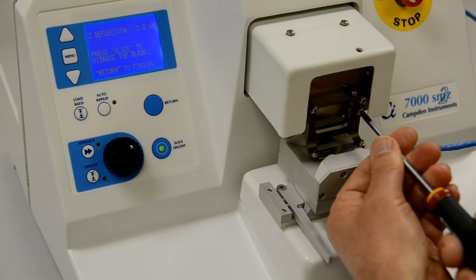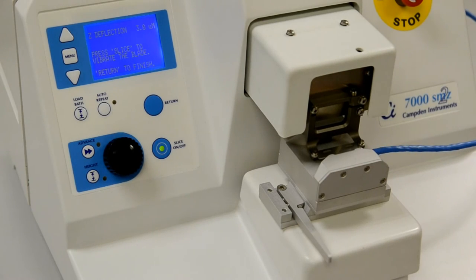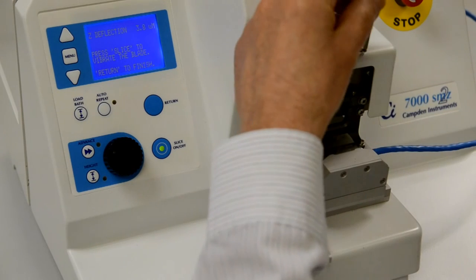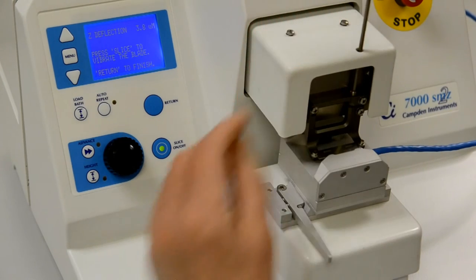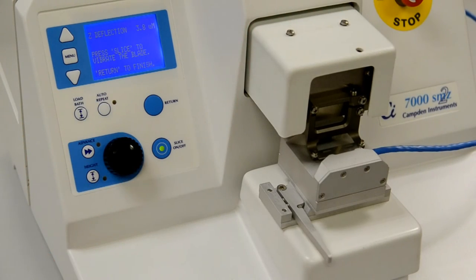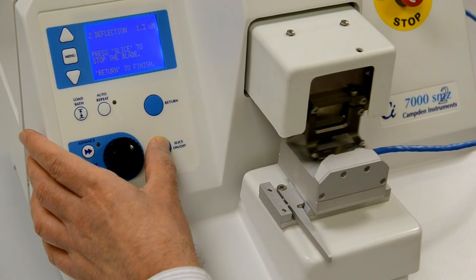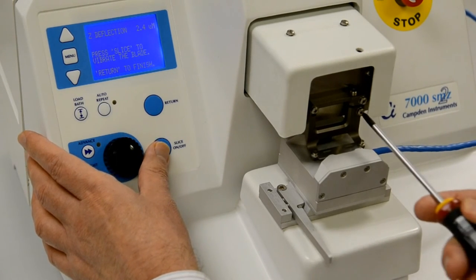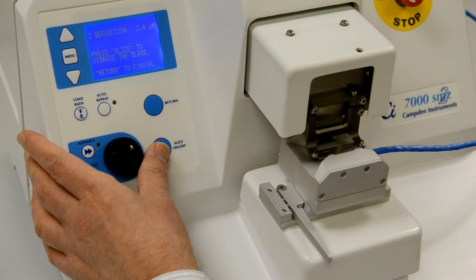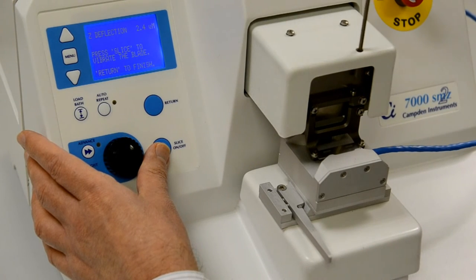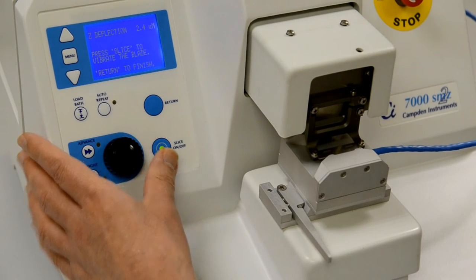On the blade holder, loosen the lower screws slightly and using a hexagonal key, turn the differential screws slightly in one direction. Retighten the lower screw and press the slice on-off key to start vibration. The optical will reassess the blade alignment error.